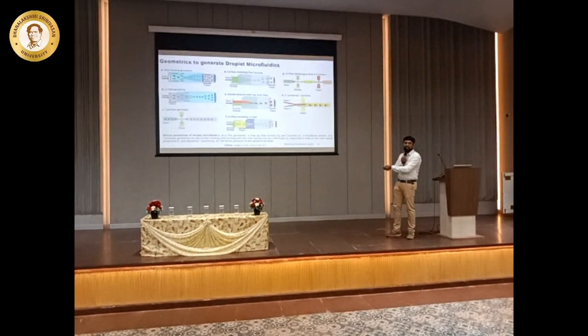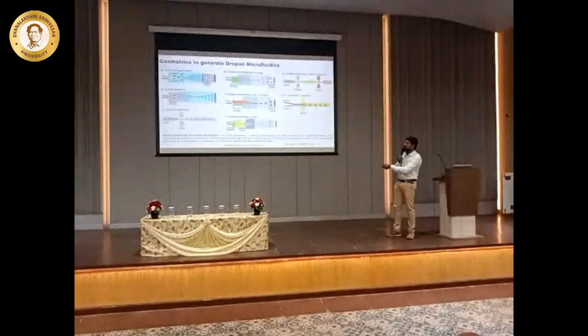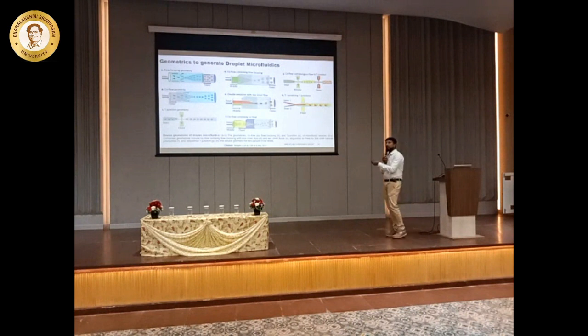The squeezing or jetting, whatever it is, is going to happen at this stage, because you have an enormous amount of flow that's going to come in, and this flow is also coming from either side, and that will break your water, and that forms a droplet. So similarly, besides core flow focusing, there are several geometries that people have designed and created to generate these droplets, and we can also modify the amount of precursors that we want to have.